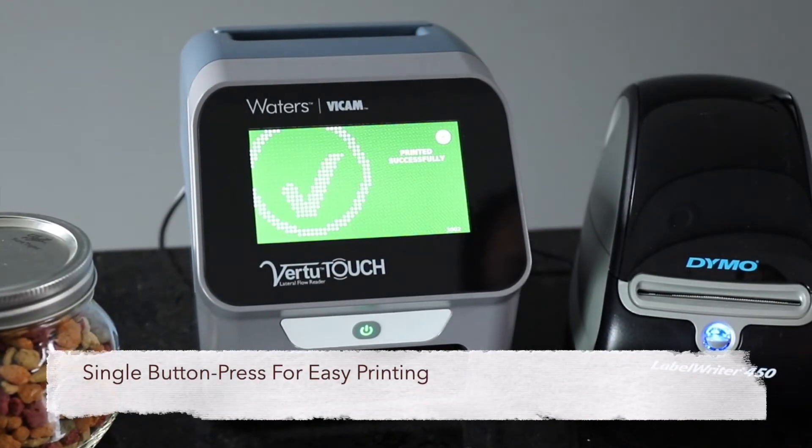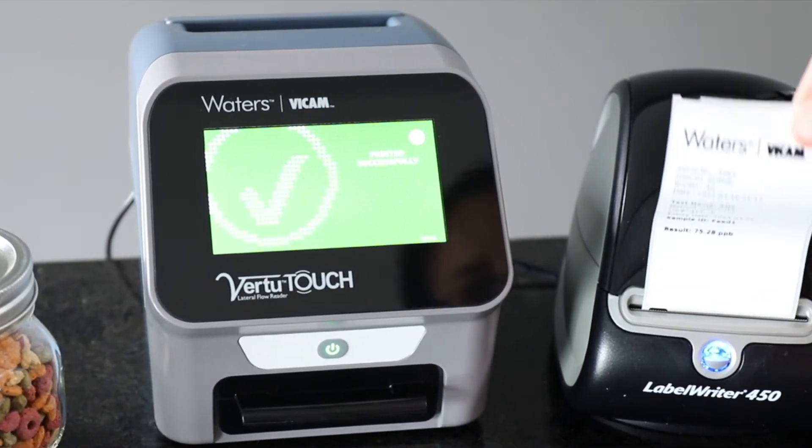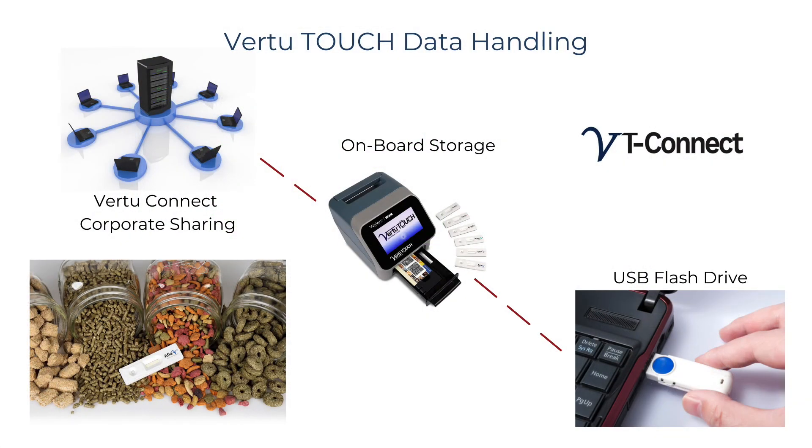Results will appear automatically on the display and may be printed with a single button press. Your results are now ready for use or transfer using onboard storage, USB memory storage, or Virtu Connect software, which enables secure data access and sharing within your operation.